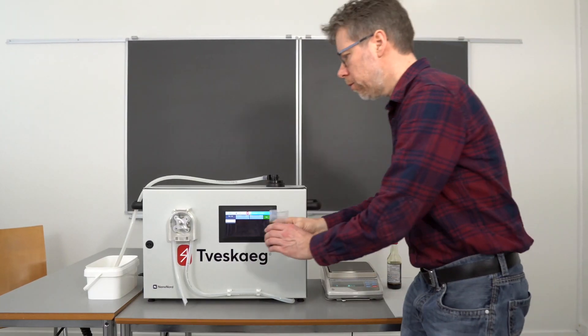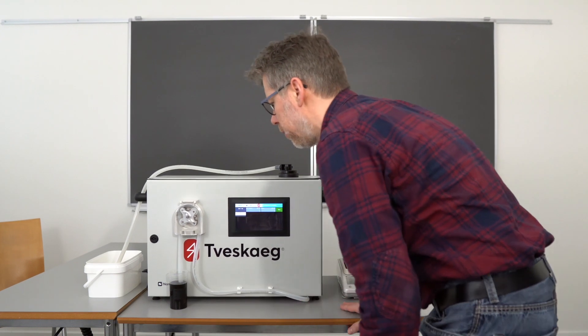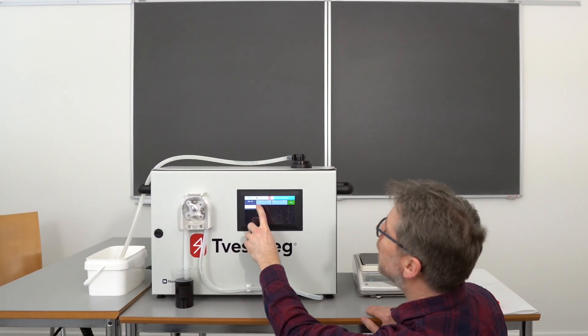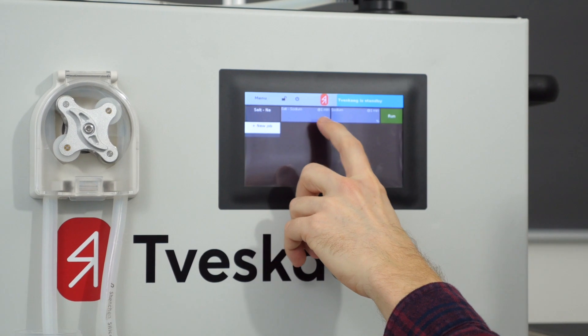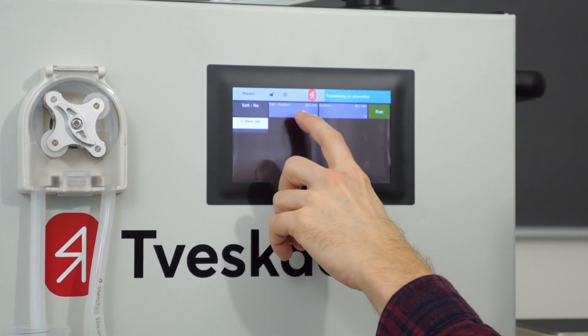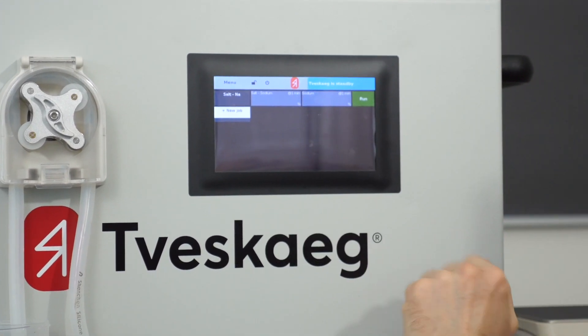You take the beaker, place it beneath the silicon tubing here, and I have a job prepared that is supposed to analyze sodium and calculate the salt content based on sodium. It will output basically two numbers: a sodium number in percentage and the salt content derived from sodium.